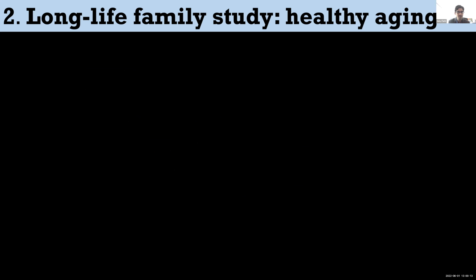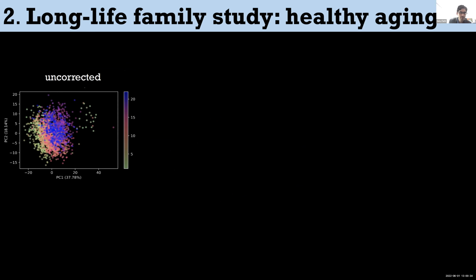The last slide that I'd like to share with you today has to do with some of the batch effects. I know that we're going to hear more about this, and there's been groups in the DTC who have focused specifically on batch effects. So I thought I would throw some of our experiences out and look forward to seeing others elaborate and say more about this as the day goes on. Obviously, when you run this number of samples, you do observe strong batch effects.